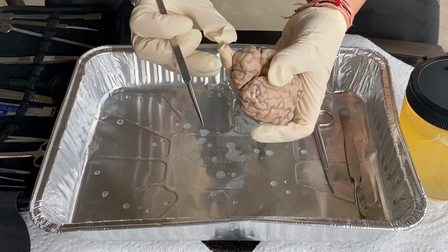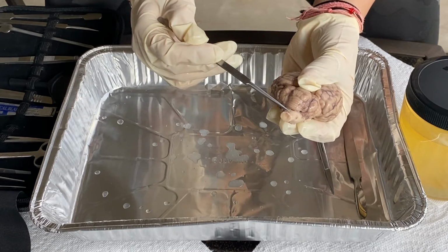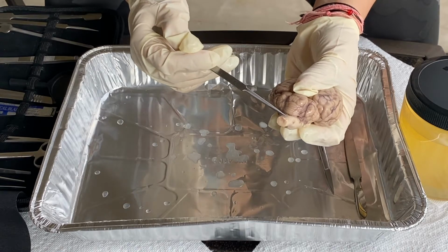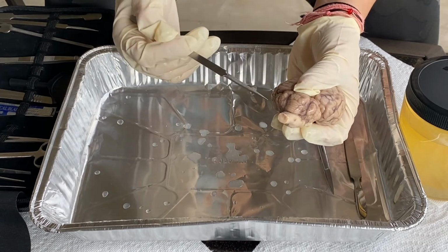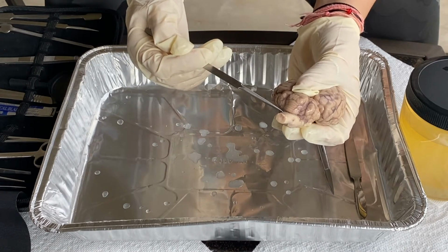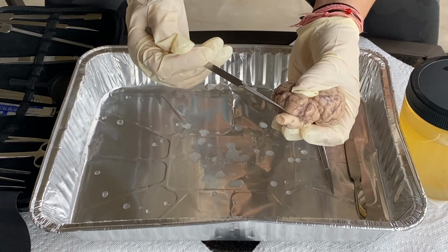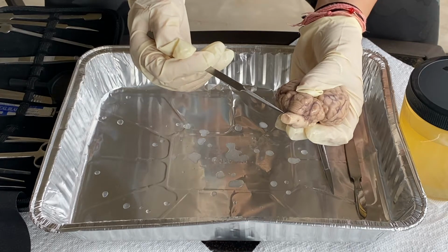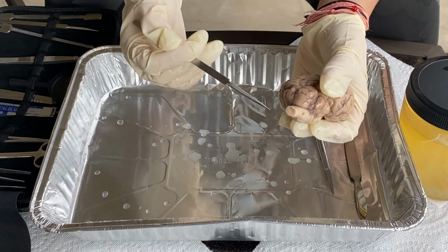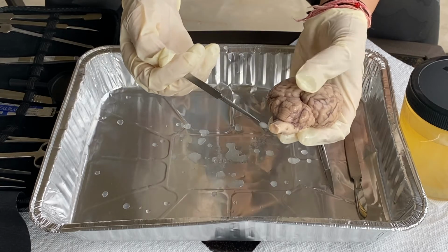This is the spinal cord. So the spinal cord is basically a column of nerve fibers which is responsible for sending and receiving messages from the brain. It runs through the spinal canal, which we can't see here, but it has a lot of branching nerves that branch in the brain, and it influences the rest of the body. It controls movement and organ functions, and it has 31 pairs of spinal nerves, which all have different functions, and they're divided into different categories.